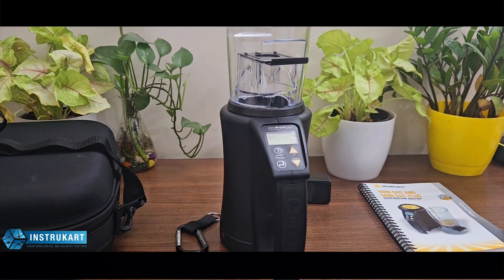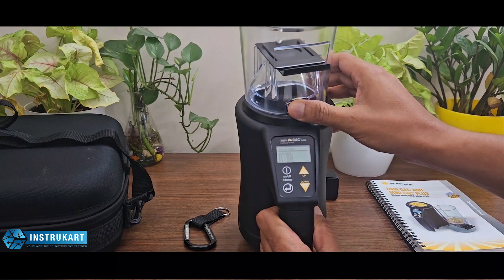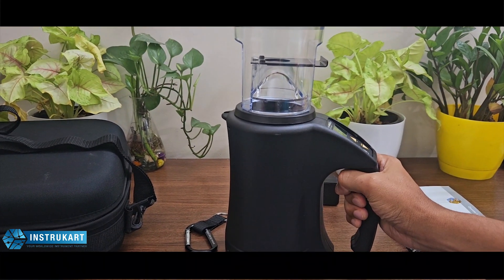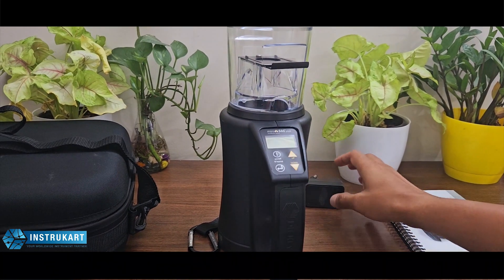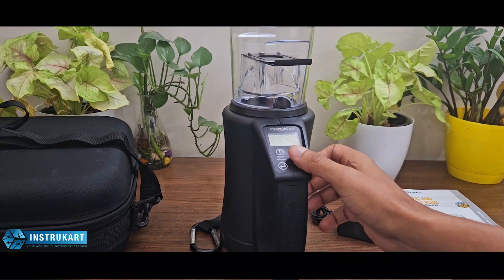It also has load calibration with a USB port. This operates with a battery, so if you carry it in the field it can be very handy. If you need to charge it, you just need an adapter to charge this particular device.